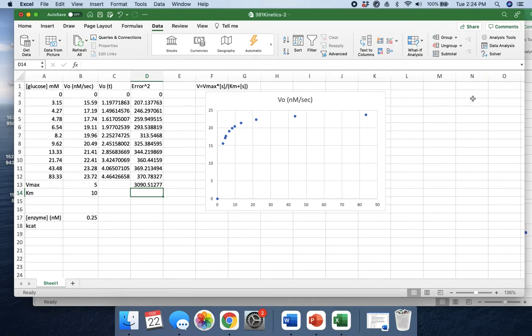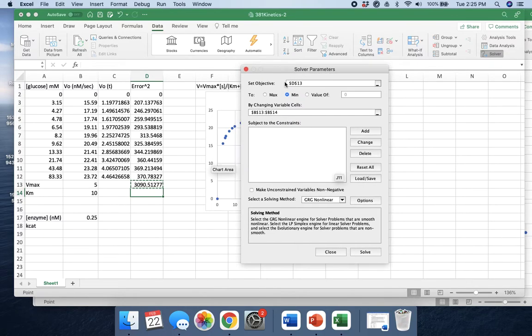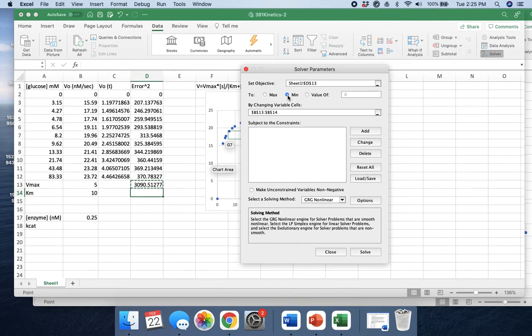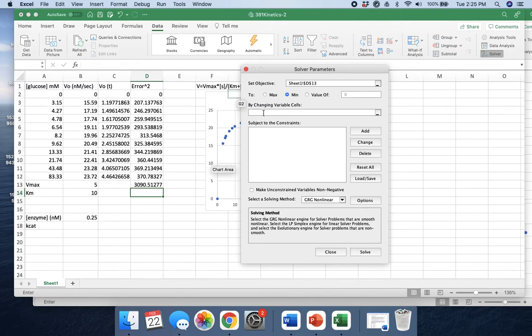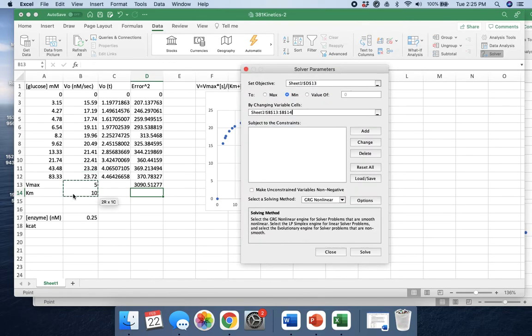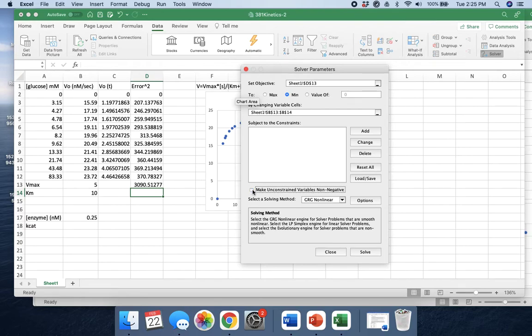Now we'll pull up our solver, and our set objective is this number right here. I was doing this before, so you can see it guessed at what I would want. Our goal for this number is for it to be as low as possible, so we keep it set on minimum. If that wasn't there, we would have our changing variable cells as Vmax and Km. You just drag over them like that and it will take both of them. Make sure this is not checked. I don't know why, but it has a divide by zero error if you check this, so make sure it's unchecked. Now we're going to click solve.